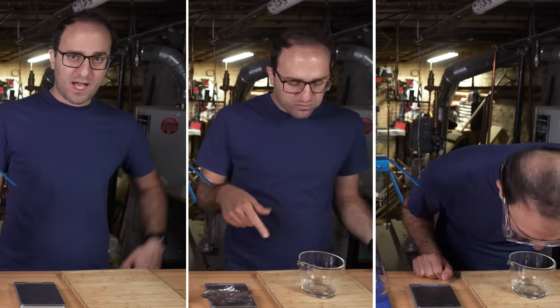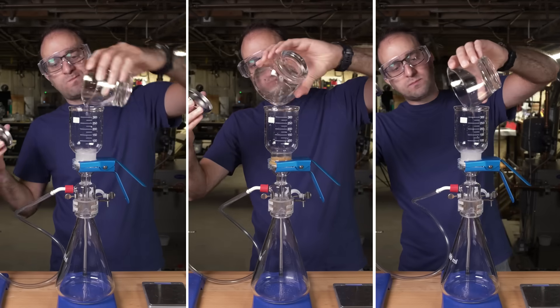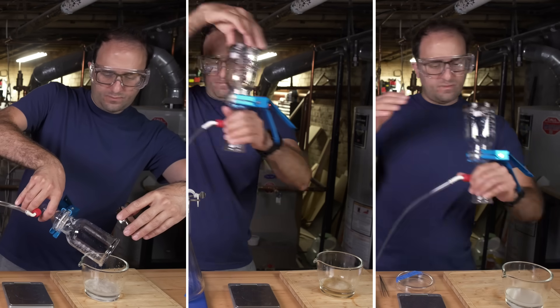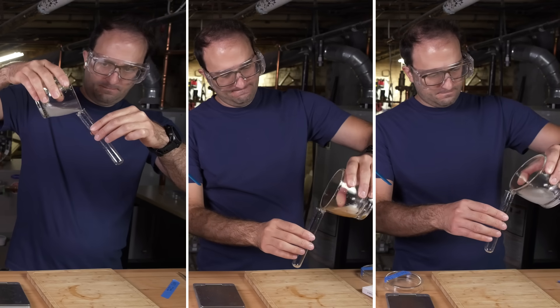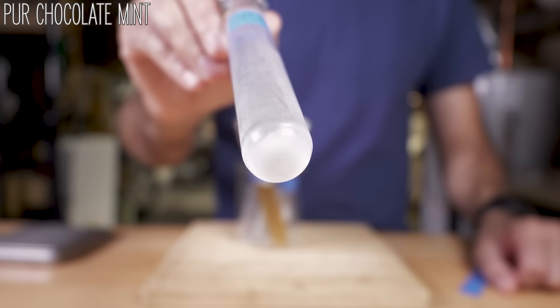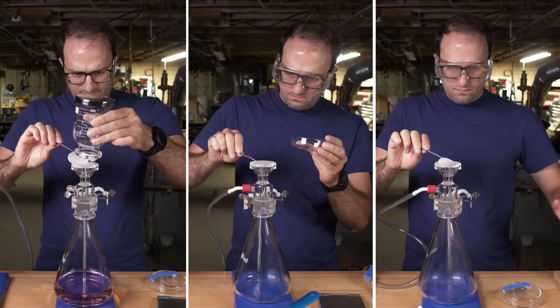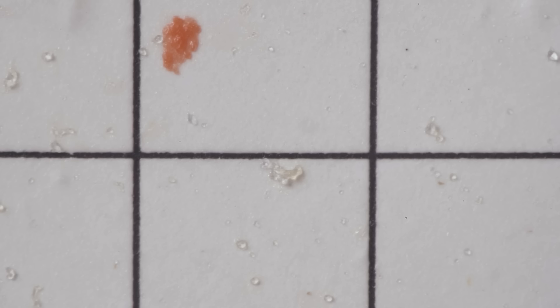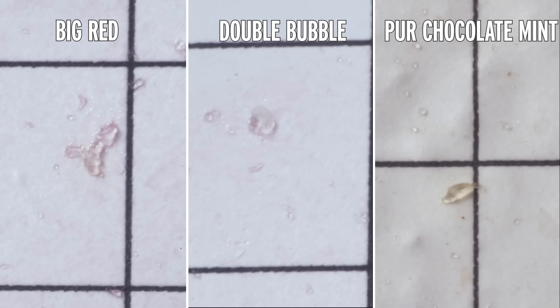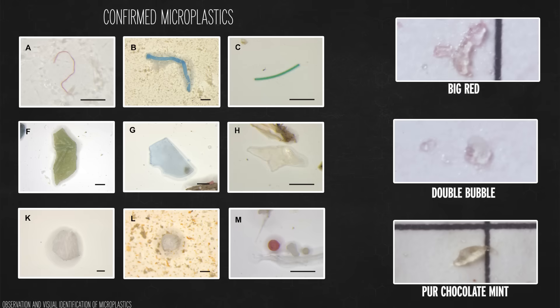I decided to test three other gums: Pure Gum, Simply Gum, and my favorite gum of all time, Big Red. None of these samples filtered either, and I did the same thing as with Double Bubble — I saved the stuff that wouldn't filter. After a couple hours of sitting around, all three test tubes had solid-looking stuff collecting at the bottom. When I looked at Big Red and Pure Chocolate Mint, both had exactly the same type of particle that was in Double Bubble — they all look very similar, but they don't look like classic examples of microplastics.